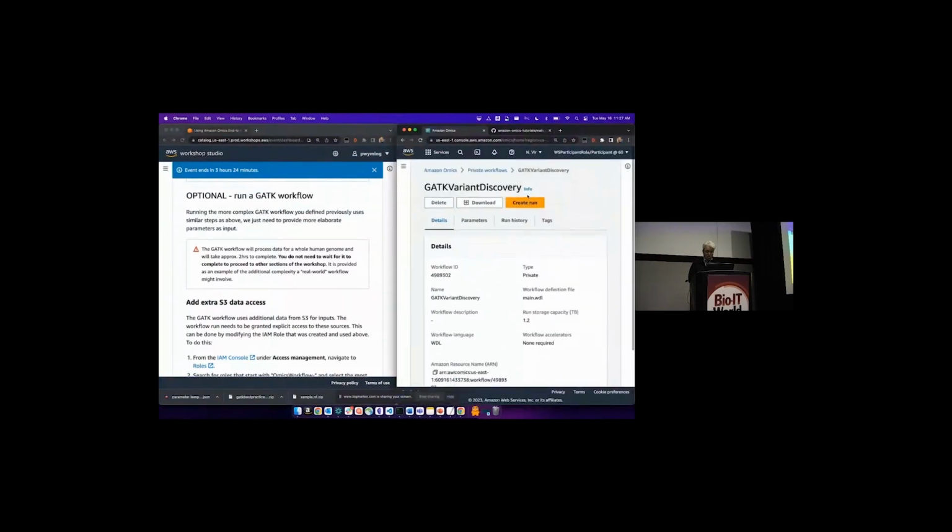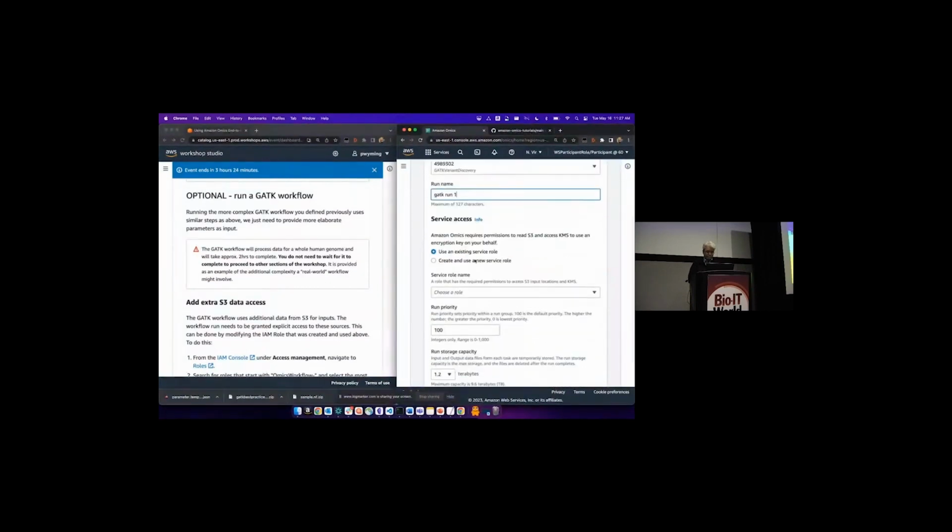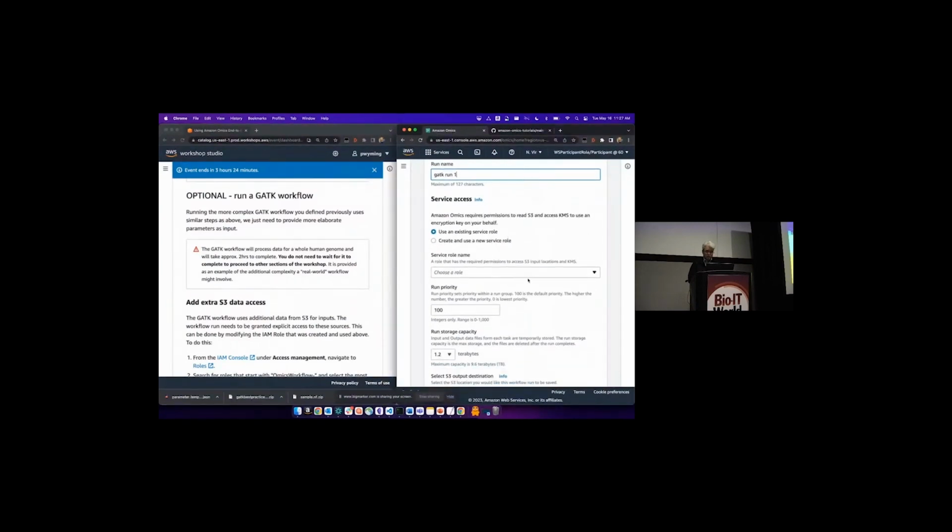And we're going to create a run. We're going to say GATK run 1, fun run. Run 1. In this case, I'm going to use an existing service role.